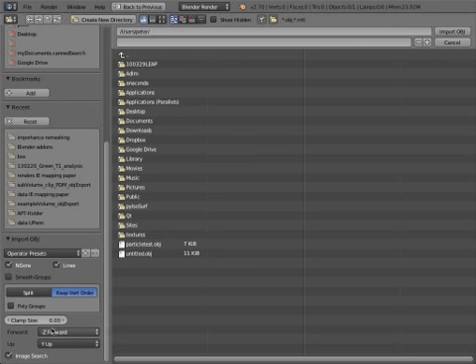You can either use the coordinate system as it is here, but that makes navigation a bit of a pain. So usually I use X as the forward direction and -Z as the up direction.